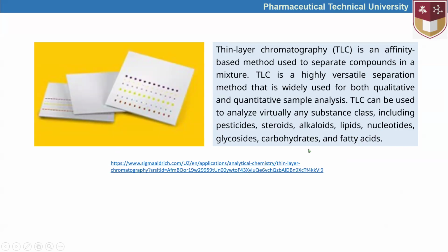And the inclusion of hydrophobic compounds is also significant. Or vice versa, for the fatty acids, we can include solvents like hexane or ethyl acetate to provide for them to be separated from each other. I mean, for compounds with higher hydrophobicity and lower polarity, we need to provide a mobile phase with lower polarity as well.